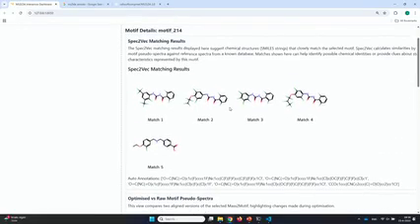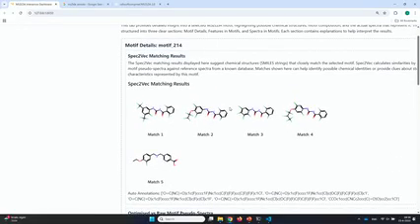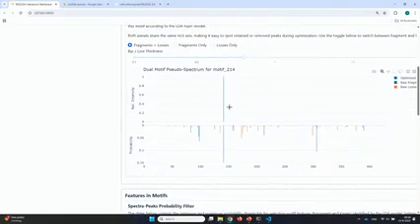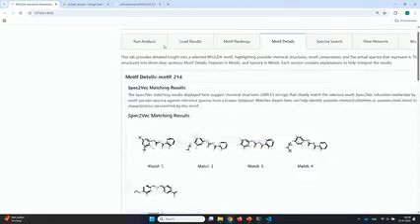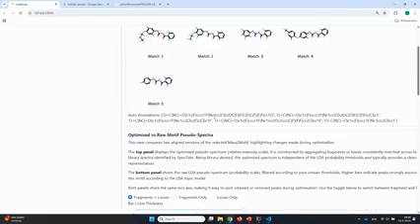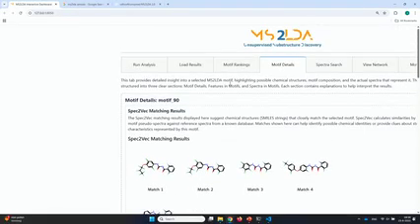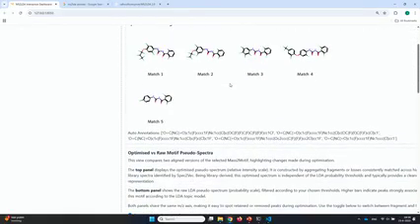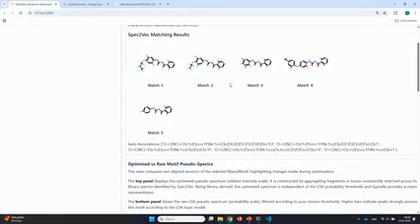Okay. Let's go to the 214 then instead. Then we would go down, right? We can see here's actually only one common fragment, which is the 141. So therefore, I want to have the 90. Now it works. Perfect. Okay, so 90, this is a better one, but a really similar substructure. We see the recommendations, they're all the same, right? So I think it's well represented.